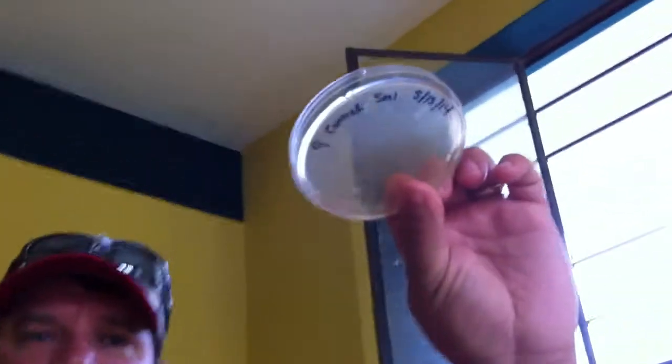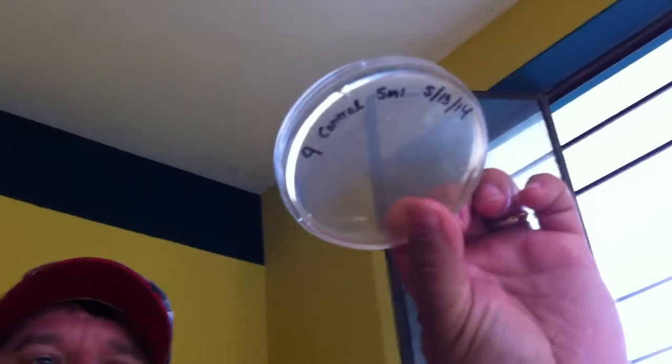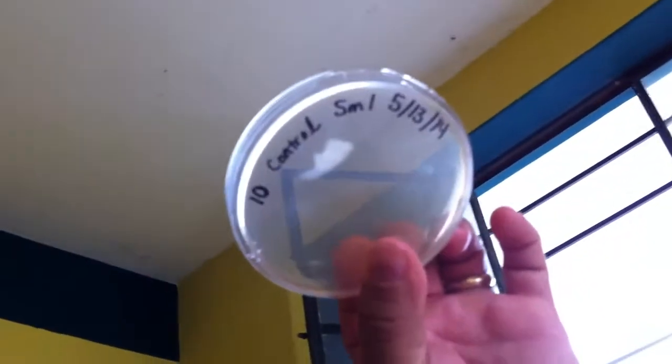Presence of coliform, gram-negative coliforms, potentially pathogenic, and E. coli. So this is just a test of presence or absence. This is your control. This is your bottled water, and there's nothing in there. That's a bubble that's growing there. And we ran 2 controls, so you see that there is no growth.